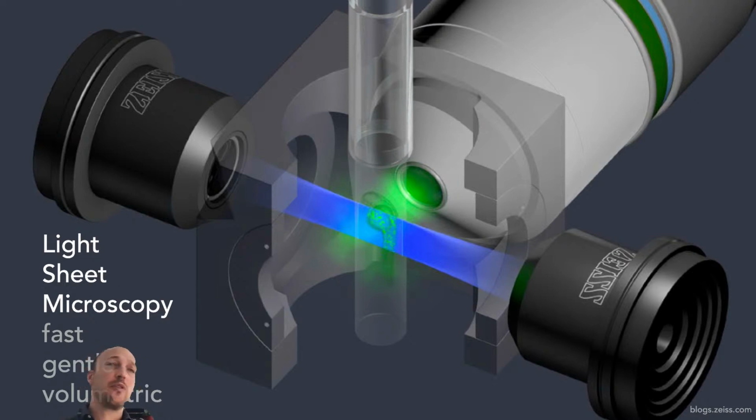And very important, by only illuminating what you look at, and by only looking at what you illuminate, you also reduce the dosage of light you have to impose on your sample, and therefore it lives longer in the microscope. In fact, we rarely kill our samples these days. They often come out of the microscope and scatter away. And we also reduce photobleaching, which means that we retain very strong signal throughout the whole imaging, which is also very important.